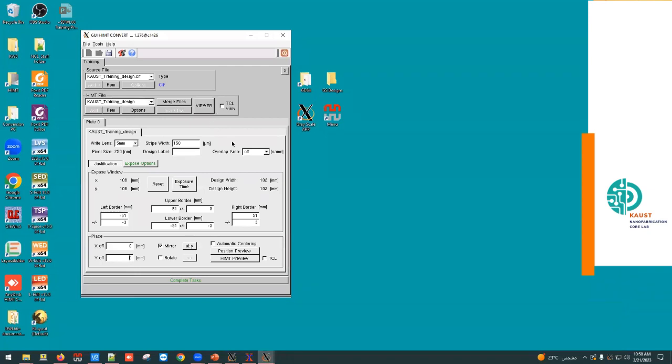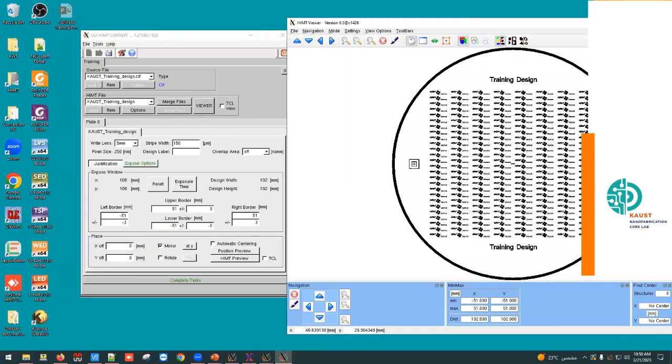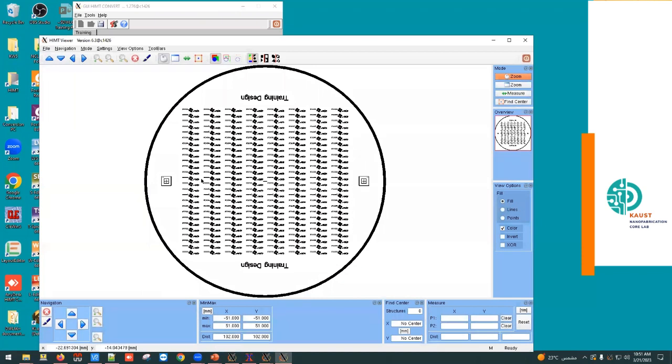And I open again to see if it's mirrored. No, it should be this other viewer. And now it is changed, because before it was in the other direction. So you can mirror either in Y or in X. But to see the results, you have seen now that it's not updating automatically. You need to close the viewer and open it again, either from here or from here. Okay, and now your design is mirrored, but it's mirroring the whole design.